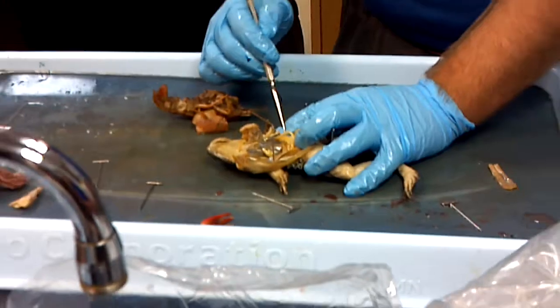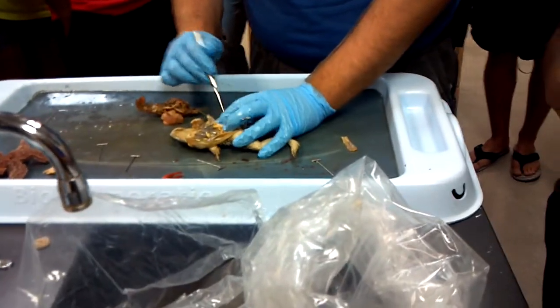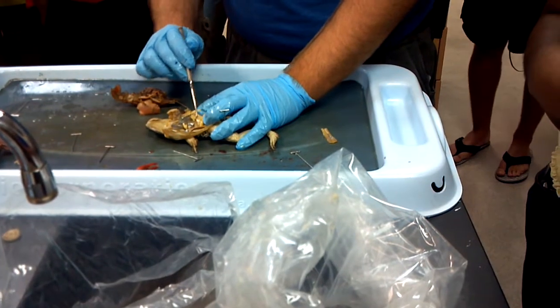This one's a very happy frog — it's got lots of fat bodies. That's all this stuff, all fat body — that kind of fingery-looking stuff. So if we get some of that out of the way, then you can see the intestines below it.